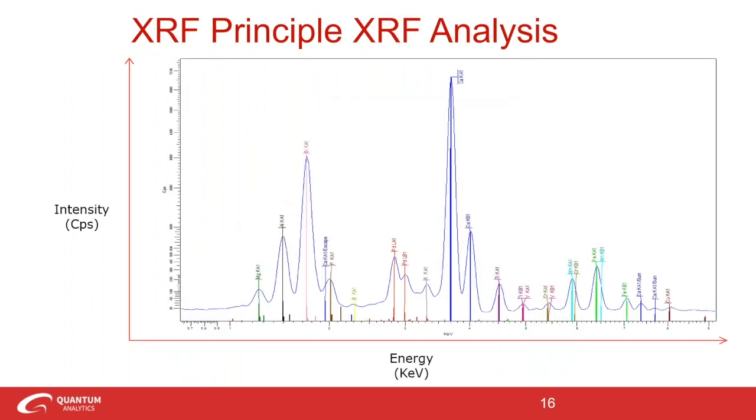And if we look at the spectra, what does it look like spectroscopically? Like this, it is the fingerprint. It is illustrated by examining the energy spectrum and its scattering peaks. When X-ray energy causes electrons to transfer in and out of these shell levels, XRF peaks with varying intensities are created and will be present in the spectrum. If you look along the X and Y axes here, the peak energy identifies the element, right?